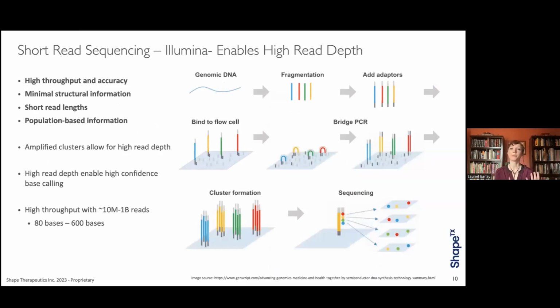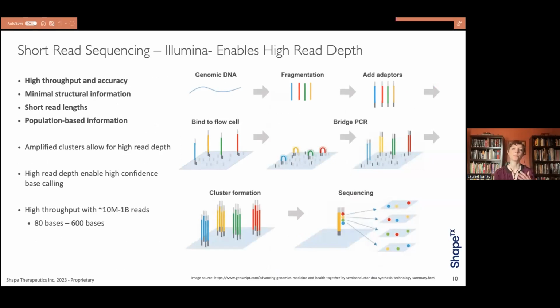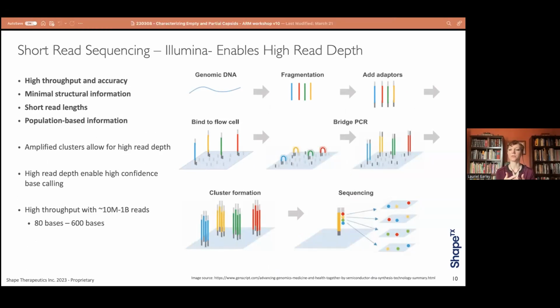Probably a lot of you are already familiar with Illumina. This is our short-read sequencing platform. Illumina is the dominant short-read sequencing platform currently, but there are some up-and-coming competitors. The important point here about short-read sequencing is that it is short. So you fragment your genomes before you sequence them. And traditionally, you're going to be looking at sequence reads with high quality between 80 and 100 bases. There are some new techniques that can get up to 600 bases, but this still, of course, is less than the full size of your genome. So these are still short reads.